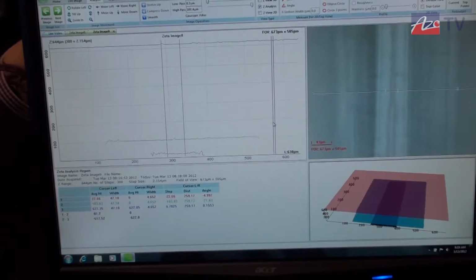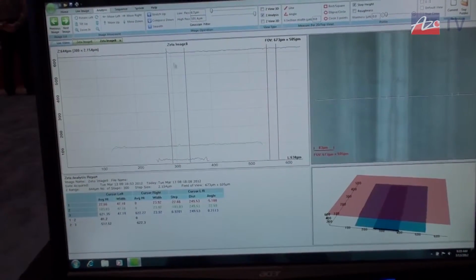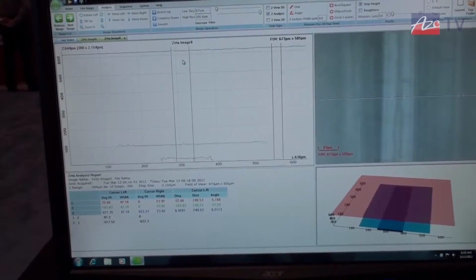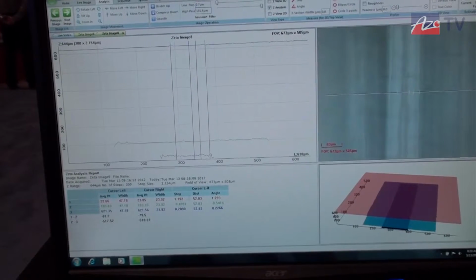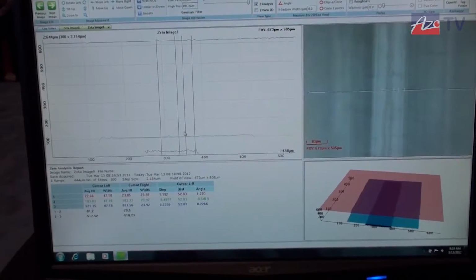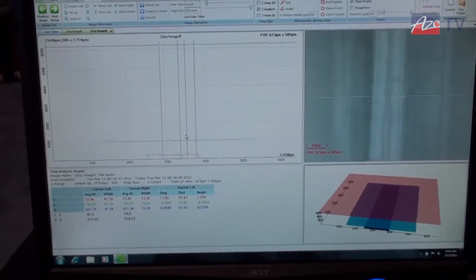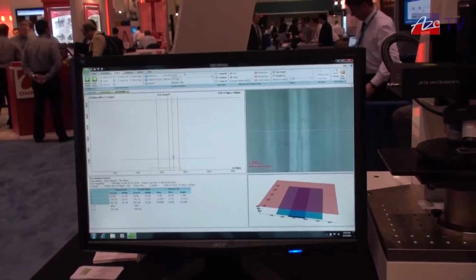But what's important is if I had multi-channels in here, depending on where this other cursor set is, not only can I look at the Z information down for differentials, I could look at the distance across based on this cursor set as well, and look from left to right, also with all of the Z information. And that's it. So you can use that to calculate, you just did, channel height effectively.